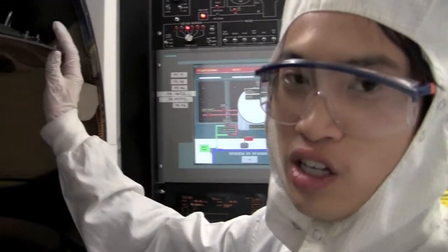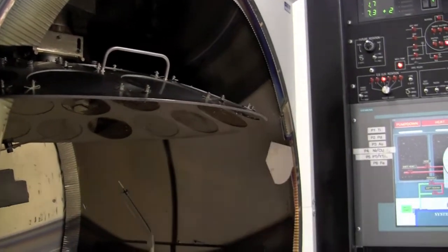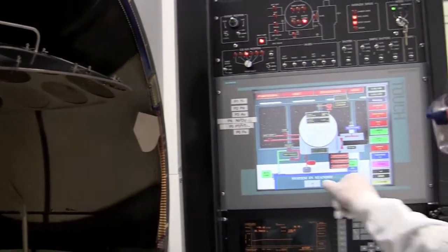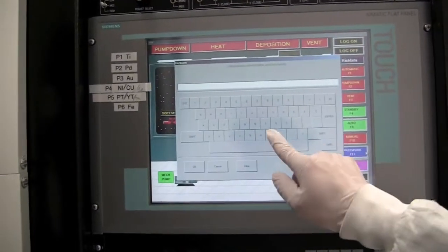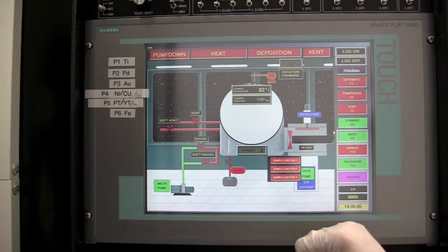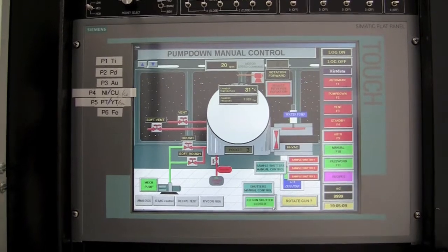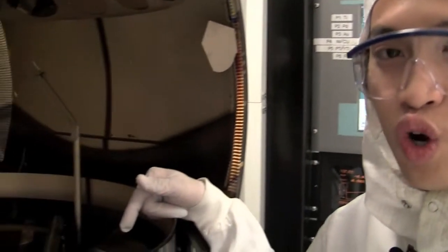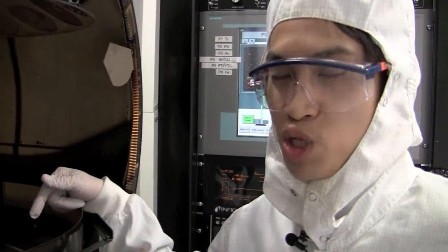Now we can unload all of the wafers that we just deposited metal on. Now, since we used gold, we're going to have to go back into manual mode by pushing password, m, enter, manual. Then by opening the shutter, I have access to measure the gold again and record in the logbook the gold consumption for that run. Now that I've measured my gold consumption and removed my devices from the chamber, I can go ahead and close the chamber back.